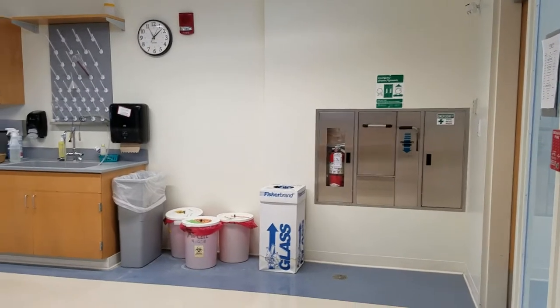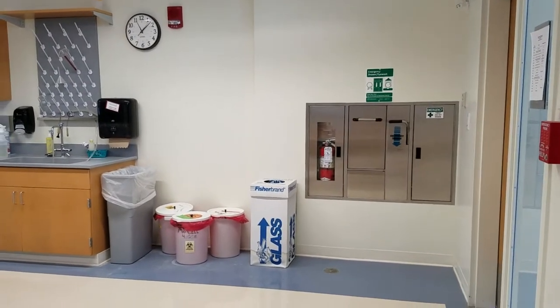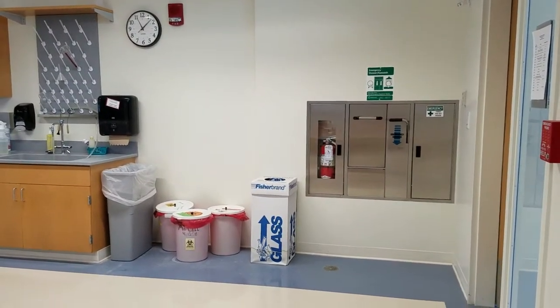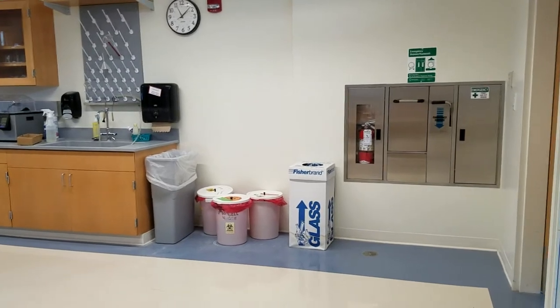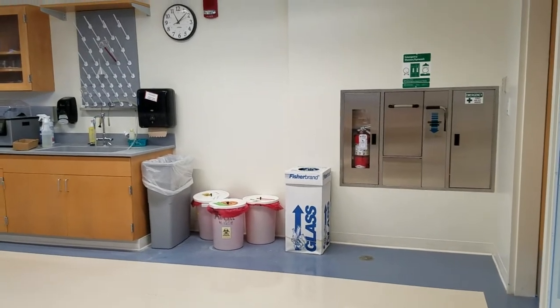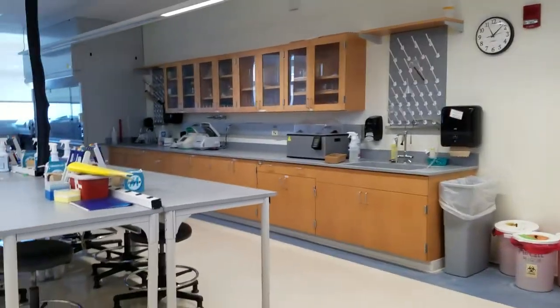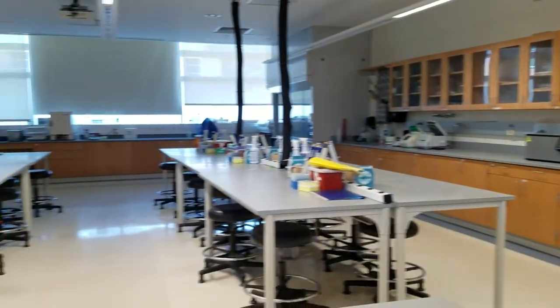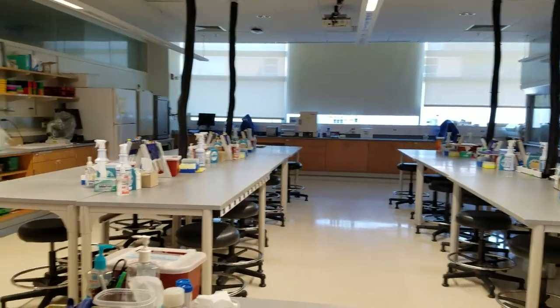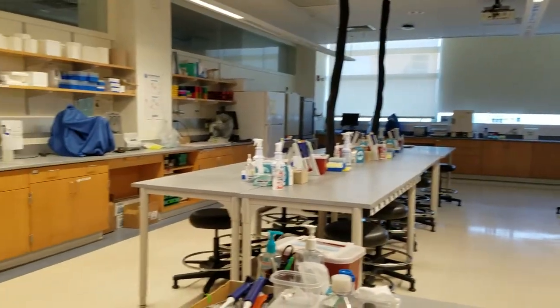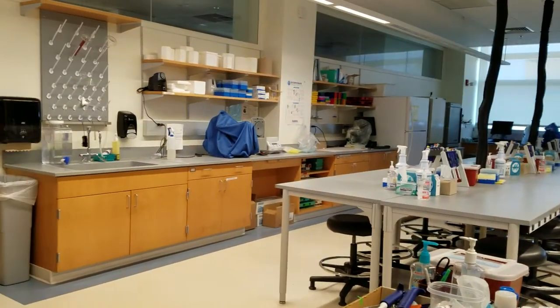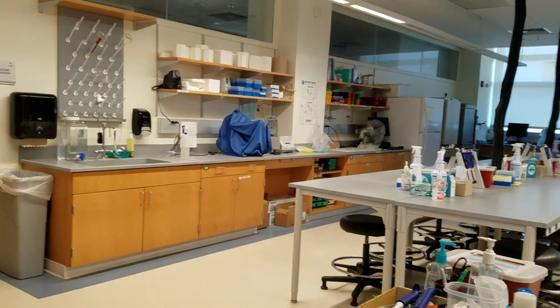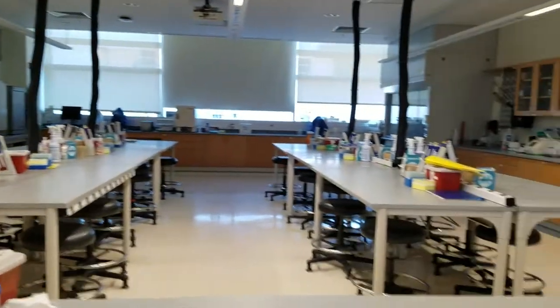Hi guys, so I thought I would give you a little tour of our lab. If you had been in a face-to-face lab, we would have been in this room in the biology department at UNF. This is the molecular and cellular biology classroom for the lab portion.